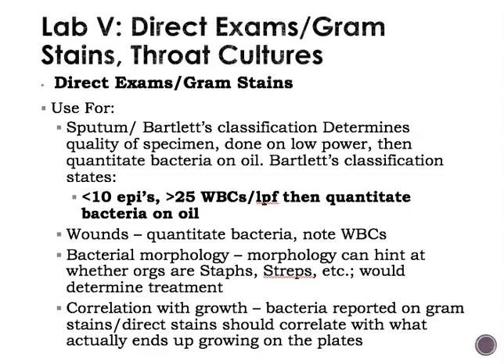Okay, for wounds, if you're doing a direct smear or a gram stain of a wound, you want to report and quantitate bacteria and your white cells. And bacterial morphology, I spoke about this in Unit 1 a little bit, can indicate whether gram-positive organisms are staph or strep. So again, that could help the physician determine treatment. If we report out gram-positive cocci in clusters, that's indicative of a staph infection. If we report out gram-positive cocci in chains, that's indicative of a strep infection. Those are going to be treated differently.